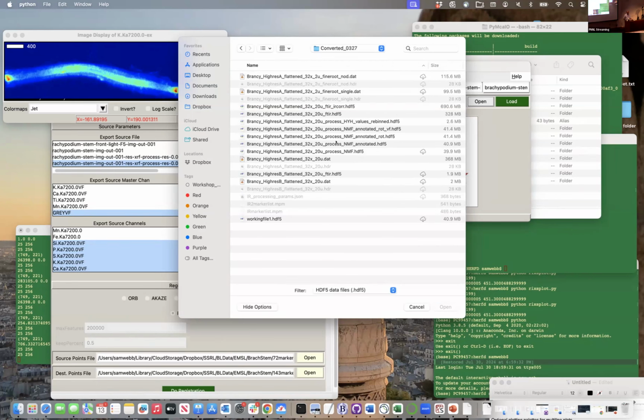So when we're opening these raw data sets, if I open up the header, in this case for the data set, it'll open up the large data set in the back, and it creates an FTIR data file for me. So that's what I tend to do with everyone else's formats. I'll support reading them, but I'm not going to support writing everyone's format. That's just way beyond my capacity and desire to want to do. But I'll put everything in the formats that I like to handle.